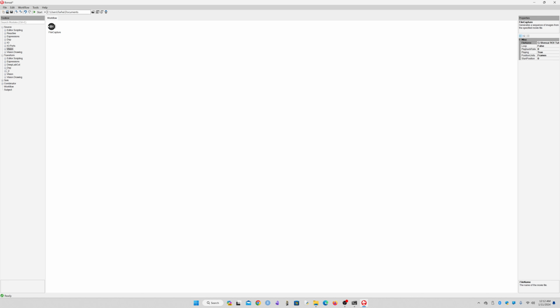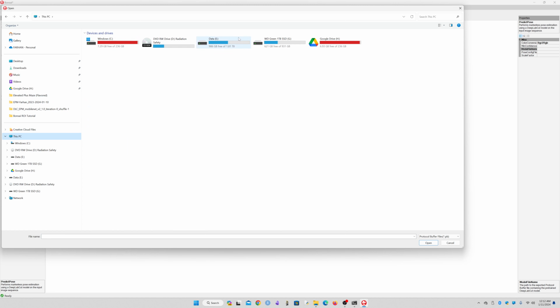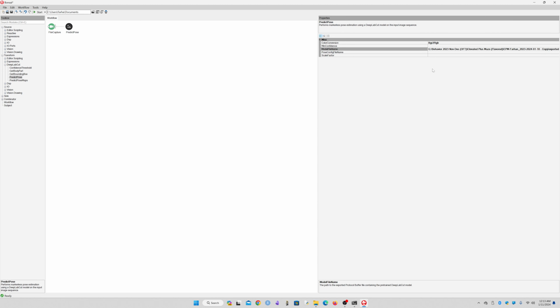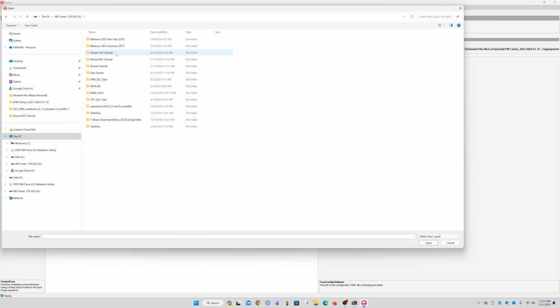Next thing is to bring in the predict pose node. For this one, go ahead and bring in your own DeepLabCut model that you have. In my case, I'm navigating over to the exported model that I exported just a few minutes ago. So ensure that your file name for the model is correct, and then navigate over to the pose config file for the same DeepLabCut model.